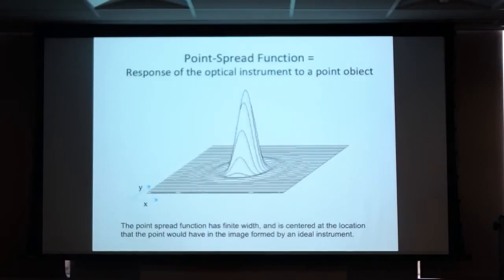So you cannot simply say, okay, I have an image of a molecule, and just form a mask around it and take this and then process it. You cannot do that, because outside of the image, there are these ripples of the point spread function that have to be taken into account in the processing. And the larger the defocus is, the larger this window is that you have to keep around the object.